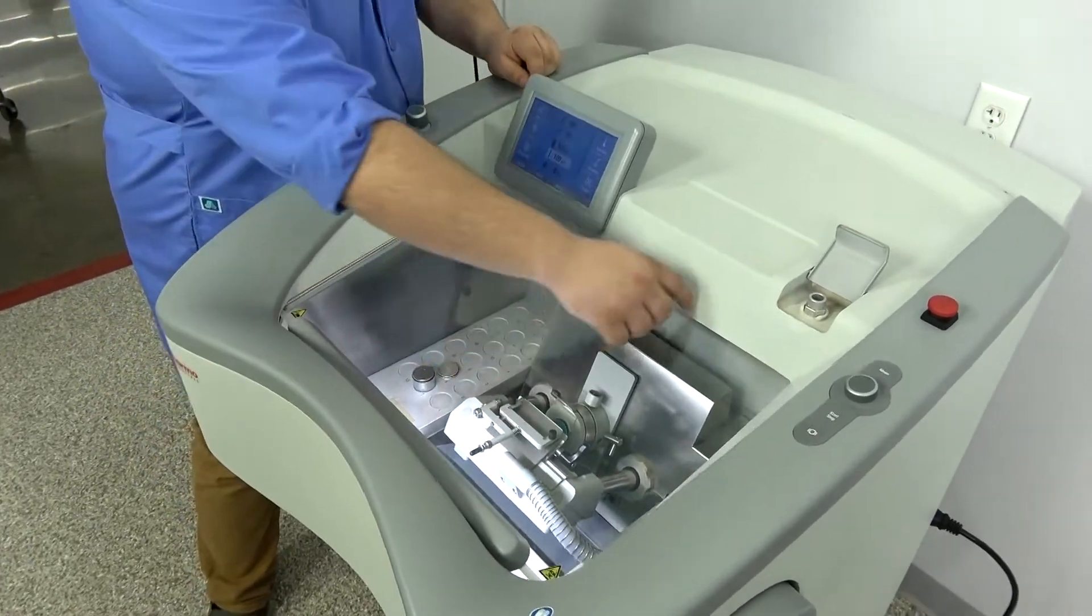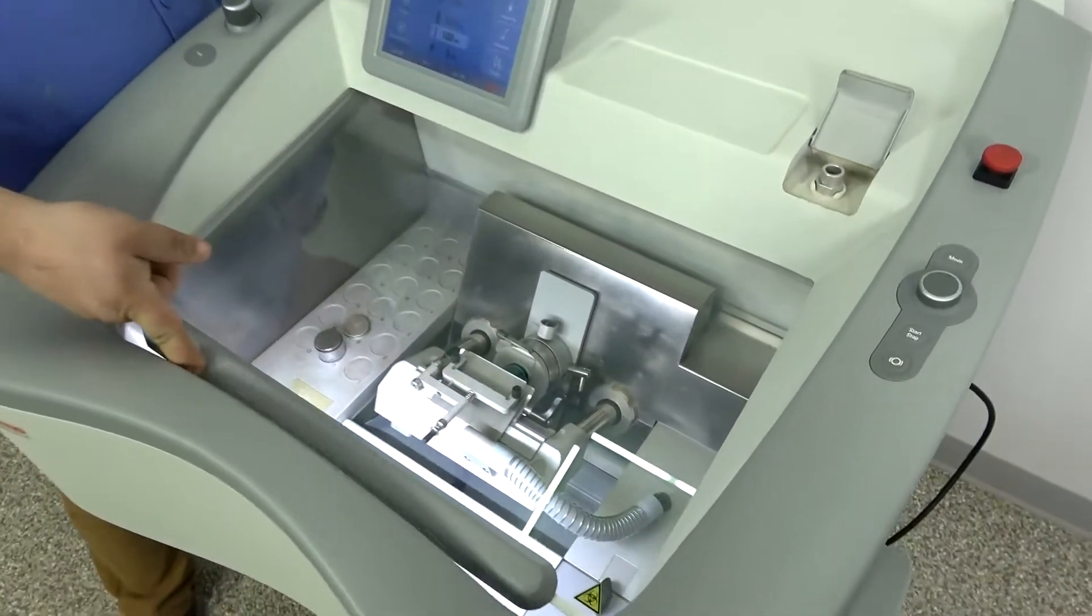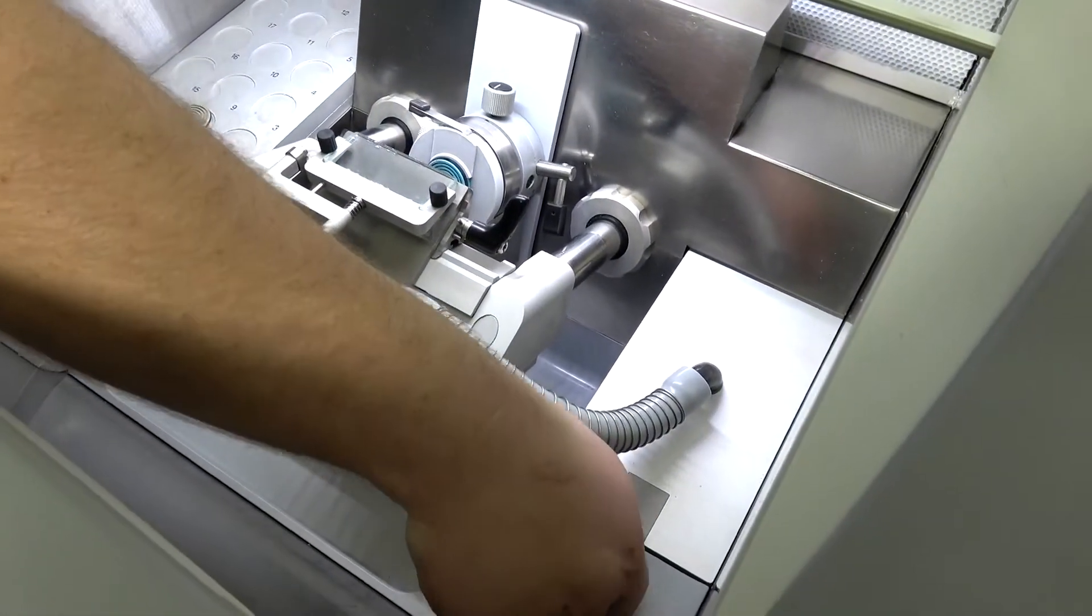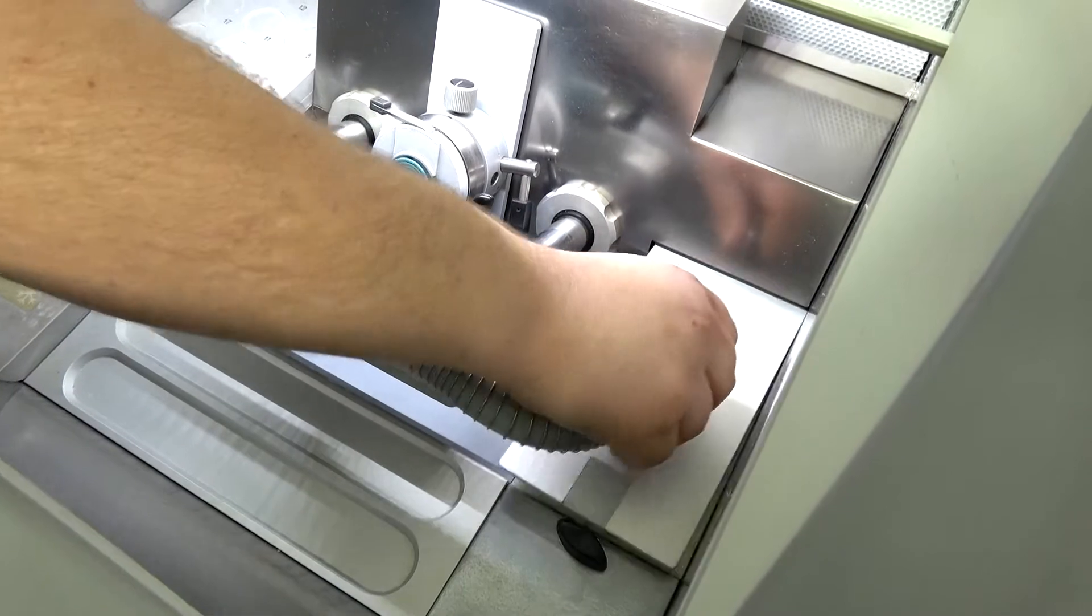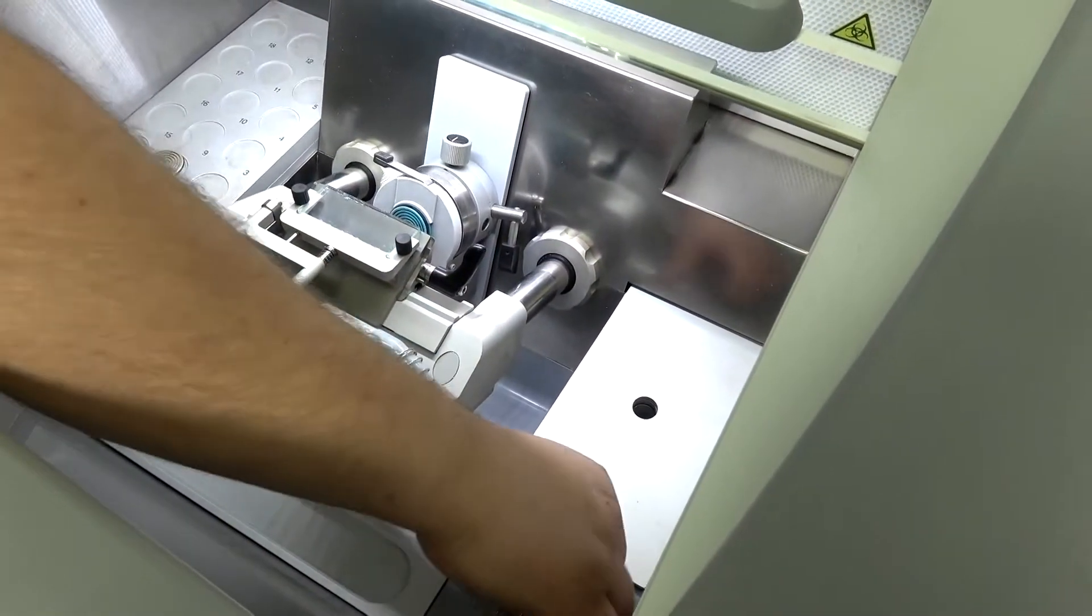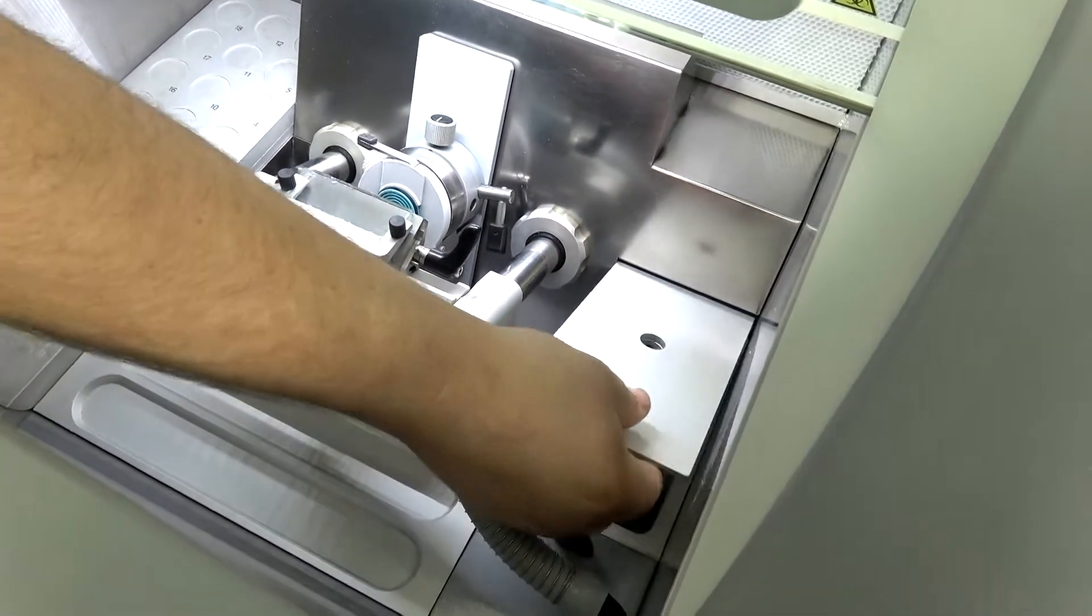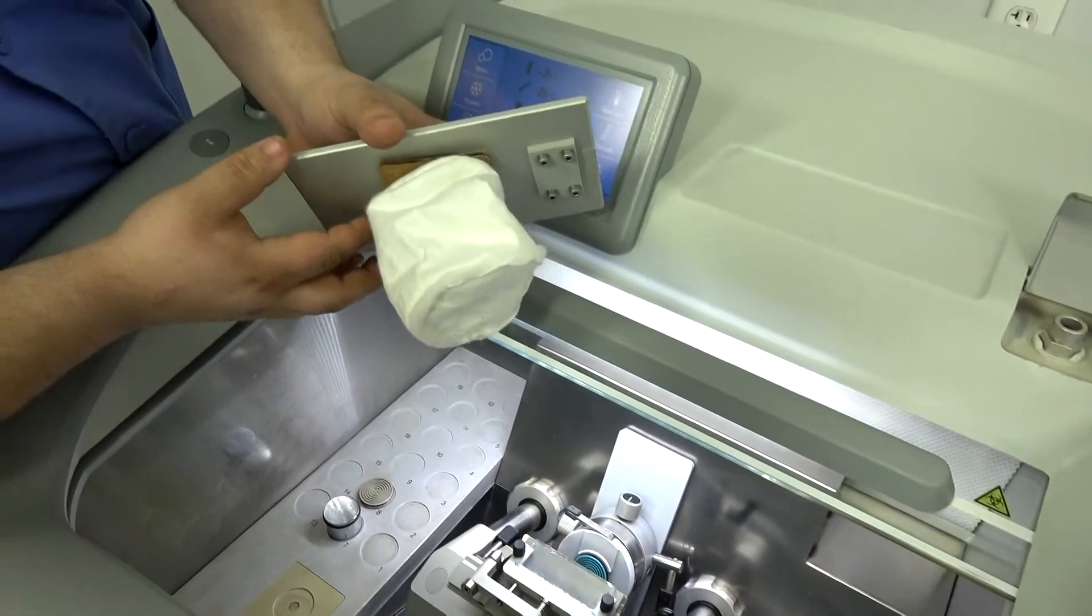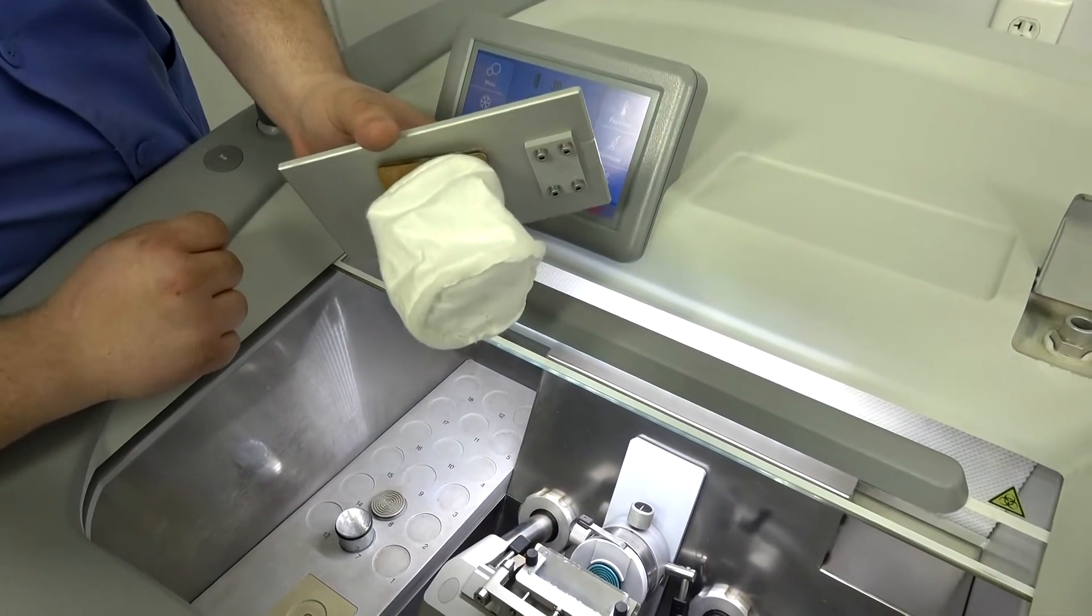We'll move on right here to your vacutome, this component down here. You reach down, pull your vacuum tube up. You have a very convenient waste basket it comes with so all your waste gets sucked into here and you can dispose of that.